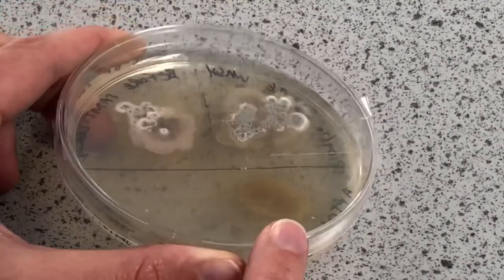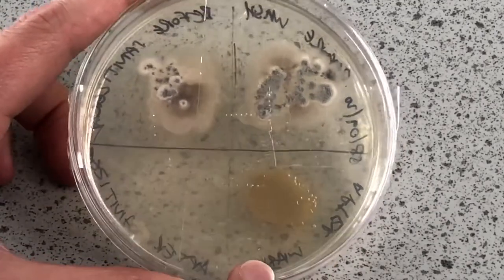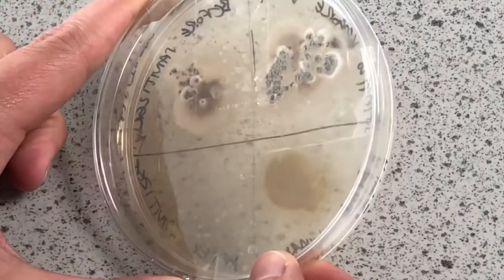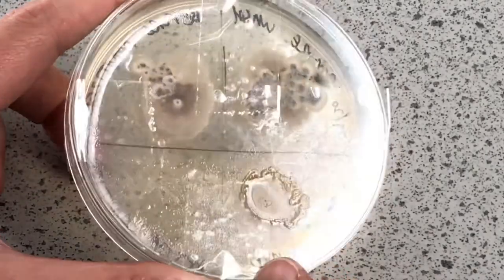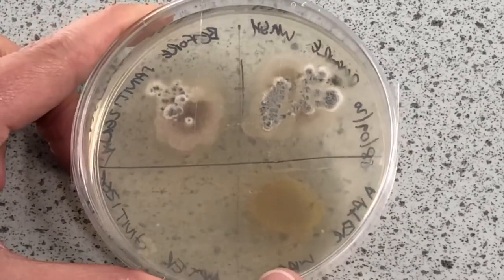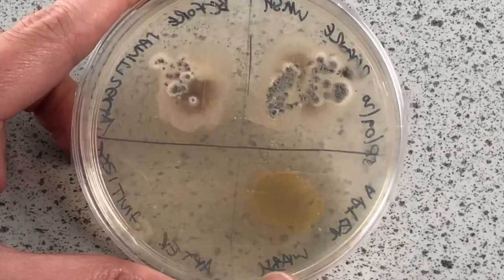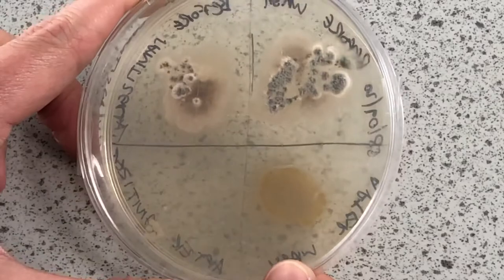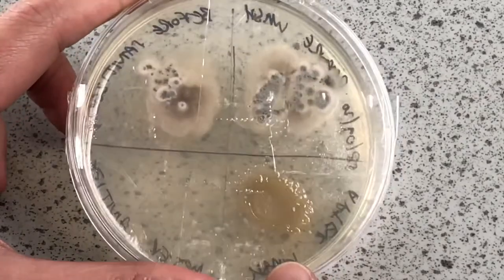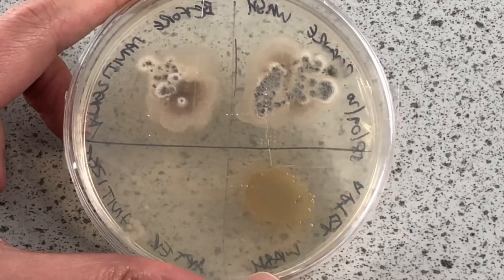That was instant hand sanitizer that kills 99.9% of germs without water. Then we had 'after hand washing', which has really surprised me — you can see there is lots and lots of yellow growth of bacteria there. I think that could be down to the use of paper towels. Maybe air drying would be better. We can't use hand dryers at the moment because of the blowing around of bacteria and other pathogens in the air.